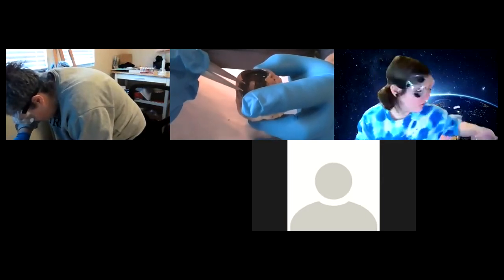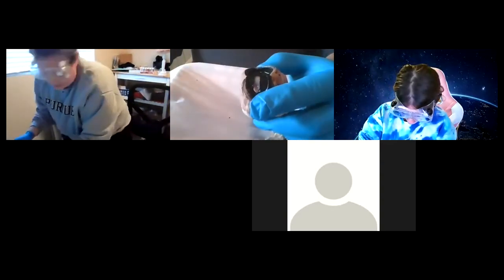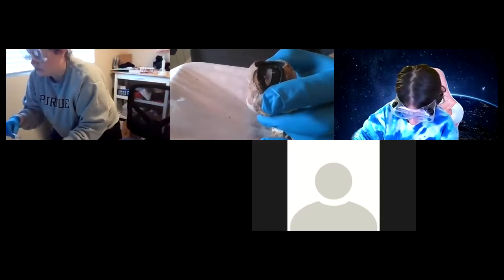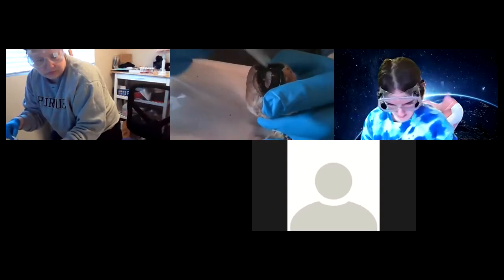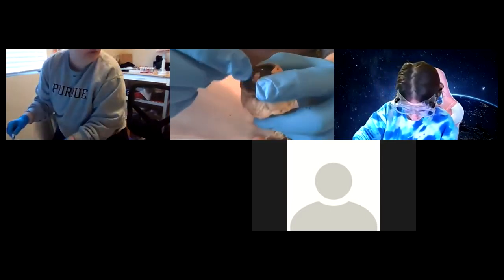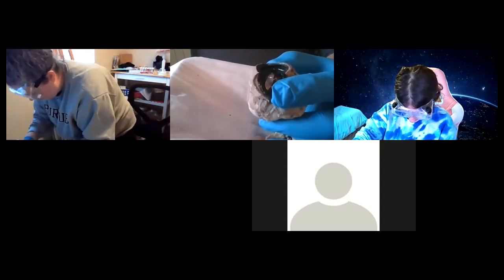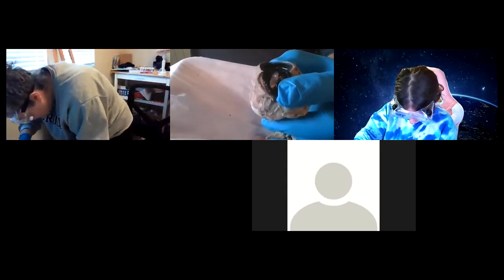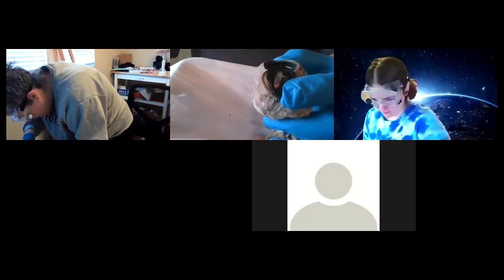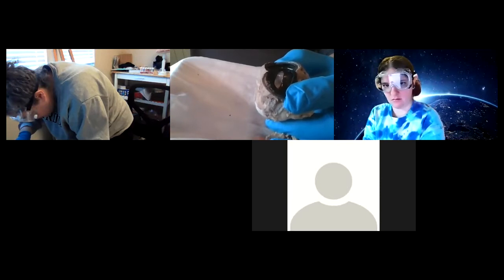Looking at the back of the anterior chamber — this hole in the middle is the pupil, and this black area is the iris. In our eyes, the iris is the colored part. It will constrict the pupil, make it smaller, especially on parasympathetic stimulation. So the pupil is the hole. Light comes in through the cornea, goes through the pupil, then the lens refracts light back onto the retina. The retina is the neural layer. The outer layer is called the fibrous tunic or fibrous layer, which is connective tissue and membrane — like the sclera, the hard part, and the cornea, the transparent part. The iris is part of a layer called the choroid layer. We'll see those layers deeper when we cut the eyeball.